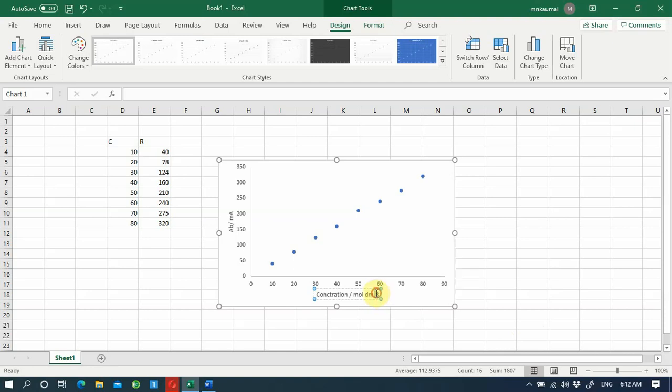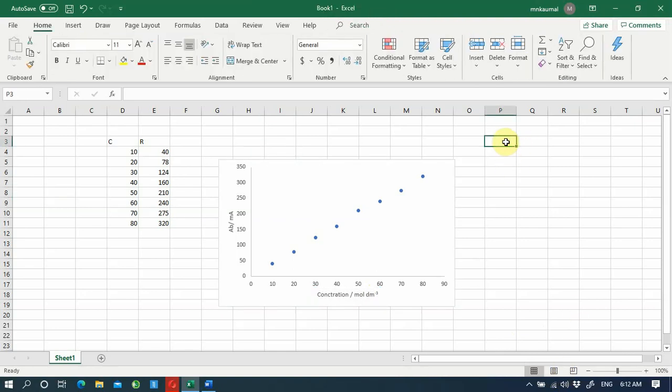I hope you can make this superscript. To do that, Control Shift plus. The keyboard shortcut, I'll write it here. For superscript, Control Shift plus. For subscript, Control plus. By doing that, you can really nicely write it.